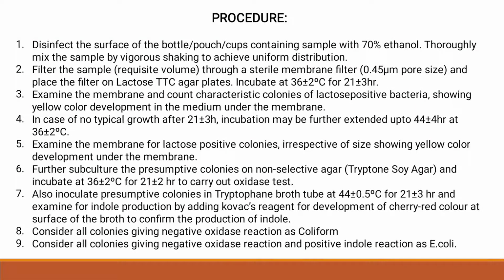So this is the procedure. First of all, we have to disinfect the surface of the bottle, pouches, and cups containing the sample with 70% ethanol. We also have to disinfect whatever utensils we are going to use for the procedure with 70% ethanol to inhibit unwanted growth of microorganisms.